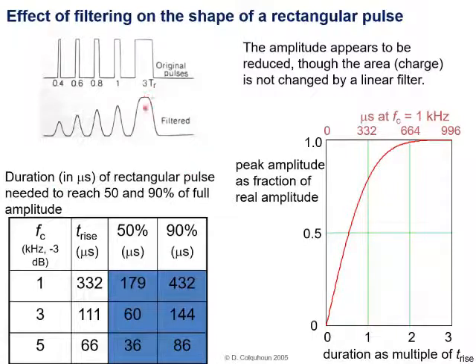Here we're making the case for openings, but of course the same thing applies for the opposite, for short shuttings. So the short shuttings will look less and less shut as they become shorter. And then at one end here, they'll end up mixing up and being difficult to tell from the baseline noise.